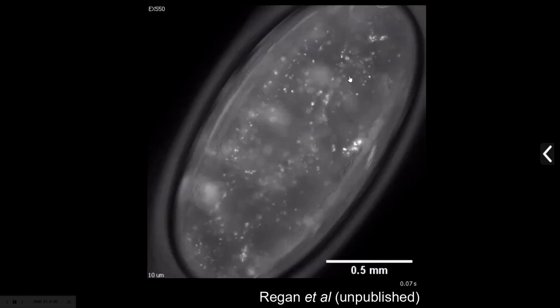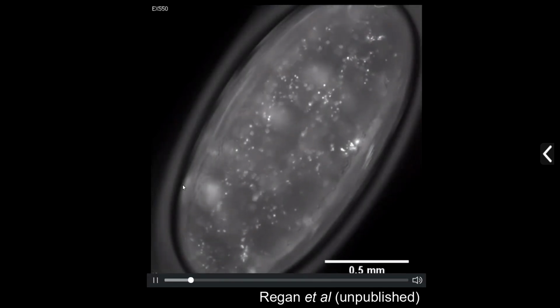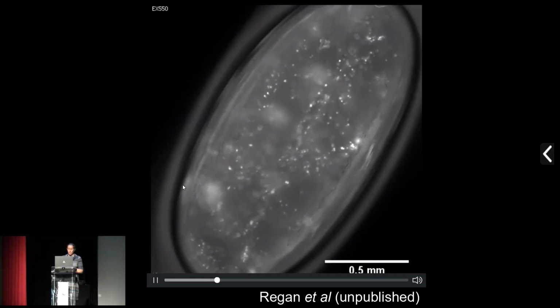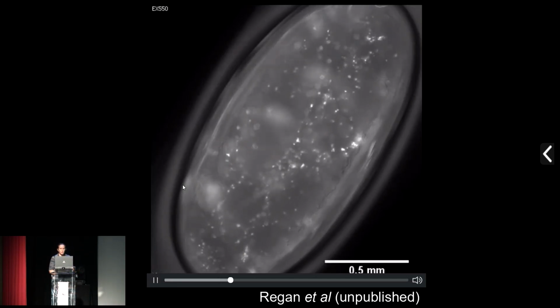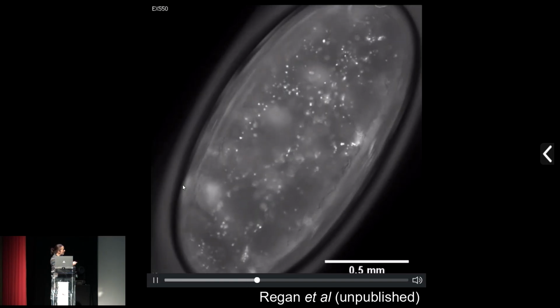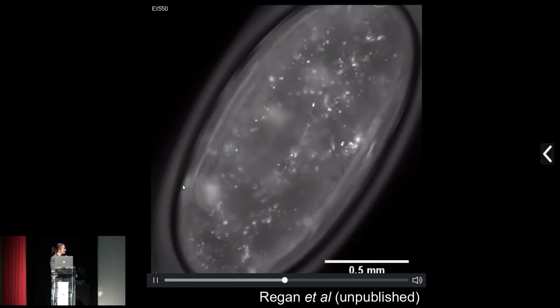Because I keep talking about fixed and cleared specimens, we are also imaging living specimens. So this is a Drosophila pupa. The hemocytes are weakly expressing green fluorescent protein. We've downsampled the field of view a little bit, and the researcher, who's based at the University of Edinburgh, was interested in the flow of the hemocytes at this fairly late stage of larval development. And what you can see is this pulsatile behaviour where they're ejected from the bottom left-hand side here, collected, and they circulate round as you would expect in the circulatory system.